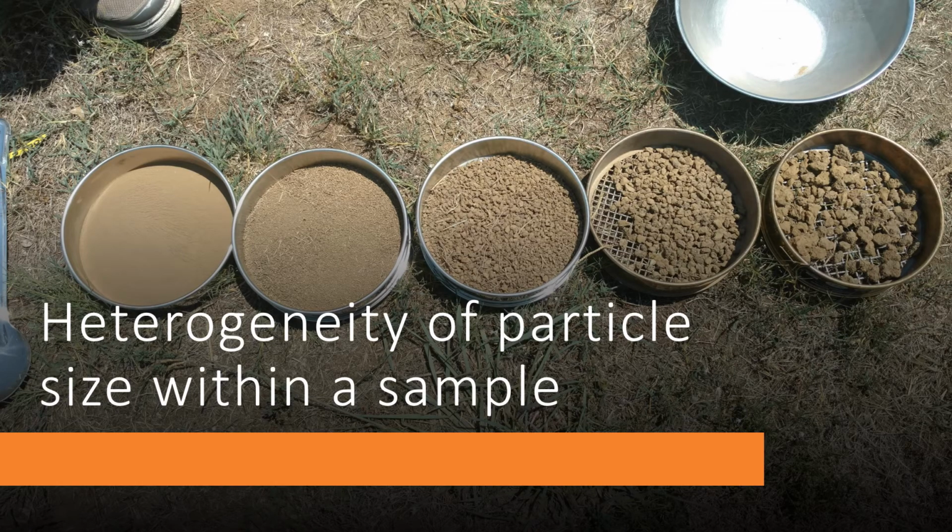One of the reasons for soil heterogeneity is the variability of soil particle size within any given sample and which fractions are selected, intentionally or not, for analysis. In the photo above, an unprocessed soil sample was passed through a variety of sieves in the field. The resulting size distributions can be seen in the picture. We could see that we have very coarse soil particles ranging all the way on the right, all the way down to very fine soil particles on the left. Taken together, these samples would create a sample that have a great deal of heterogeneity just in composition.